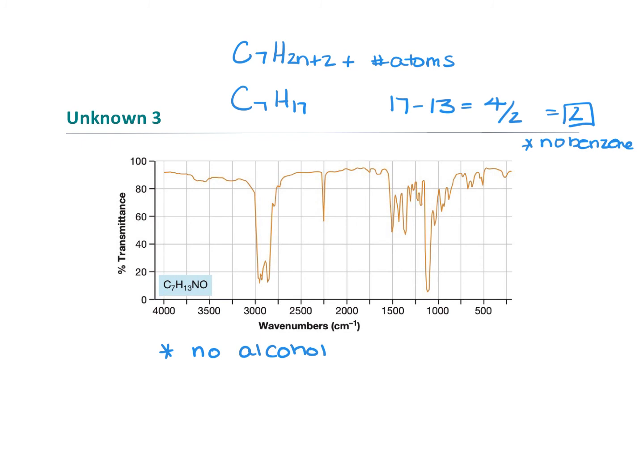We see there's an absorption right there around 2800 to 3000. Almost every structure, almost every spectra you look at is going to have that because that's the CH, and these are carbon bonds. Obviously, they're going to have those carbon molecules, so they're going to have that CH stretch. There's also a really sharp peak right there at about 2200 maybe.